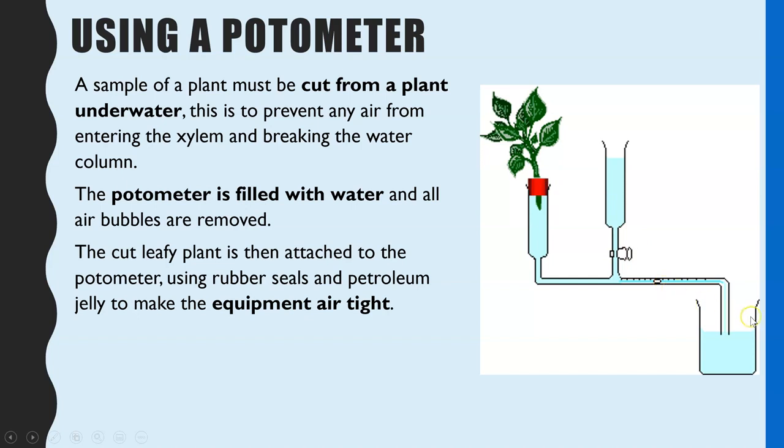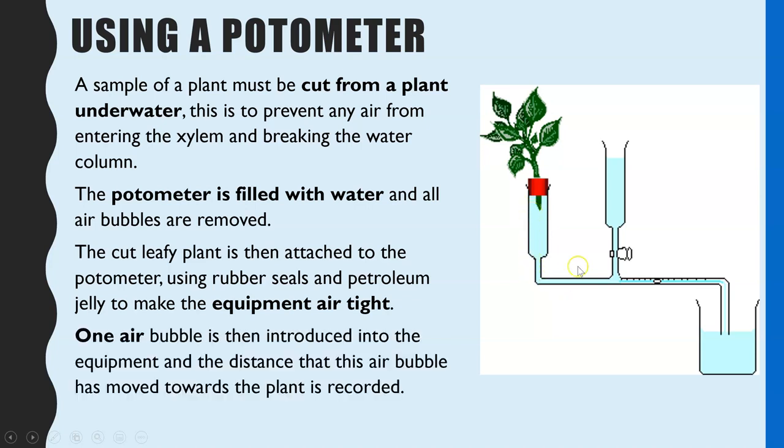to make the equipment completely airtight, to make sure no air bubbles can get in, which would prevent the flow of water, but also to make sure no water can leak out and therefore affect the accuracy of the measure of the uptake of water.